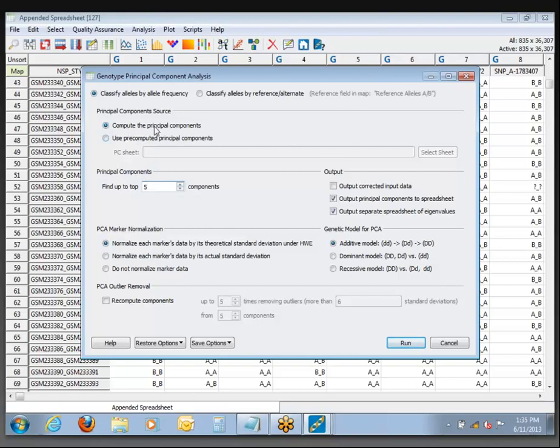We'll compute principal components and keep the default option of an additive model, normalizing based on Hardy-Weinberg. Everything should be set all right by default — go ahead and run this.